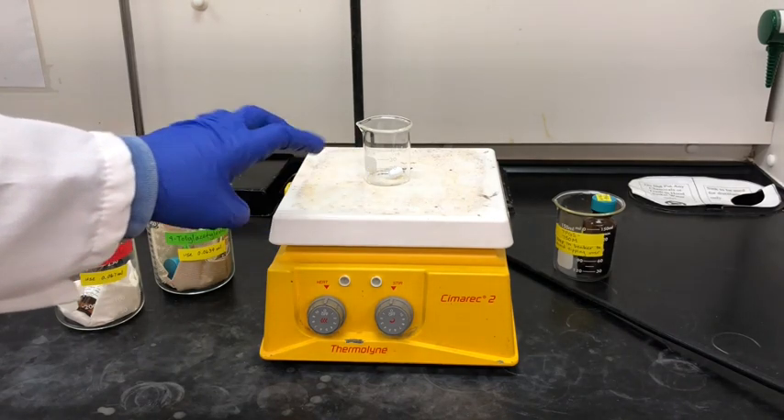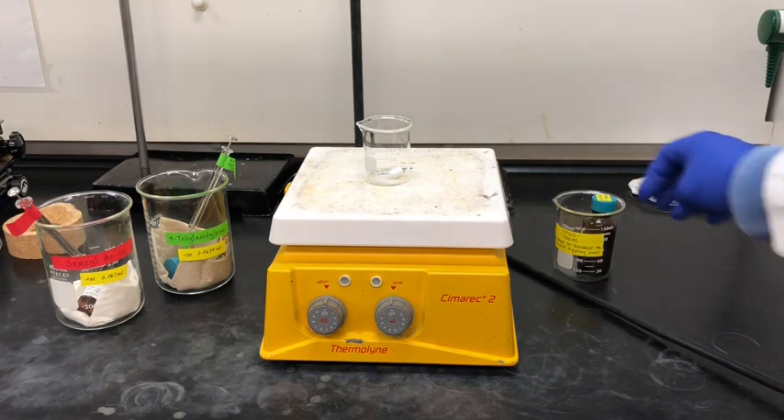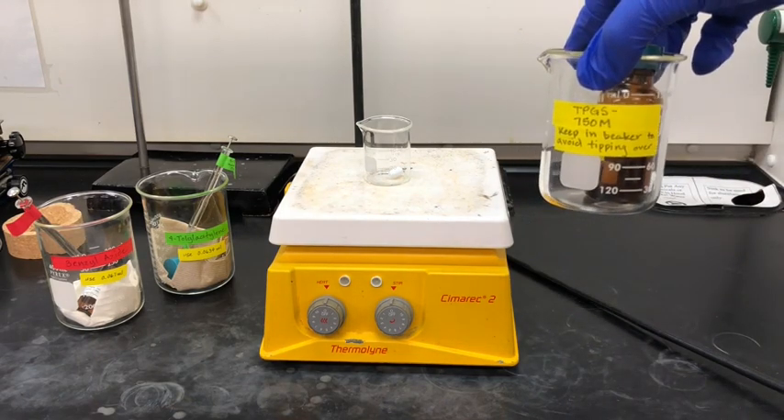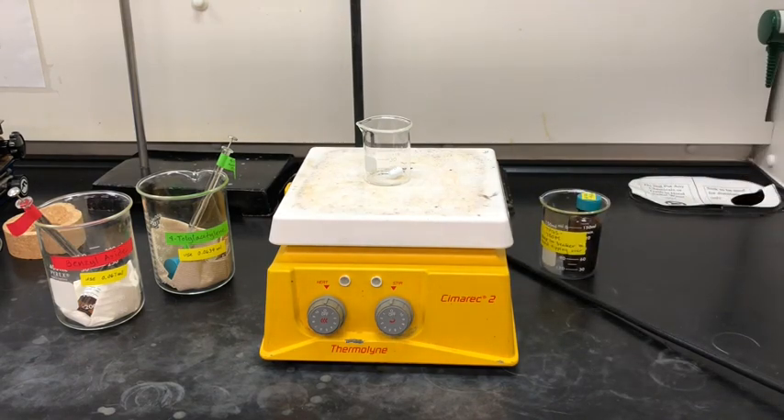You'll also need a small beaker with a stir bar, and we're just going to use the stir setting on the hot plate. Finally, you'll need the TPGS-750M amphiphile, and you can read more about amphiphiles in the procedure document.